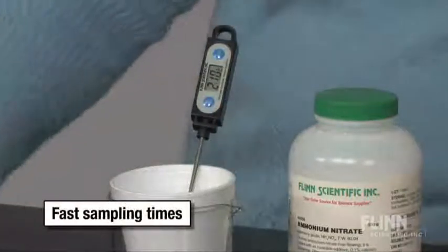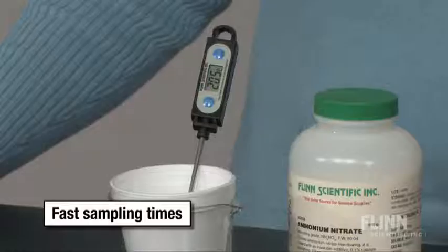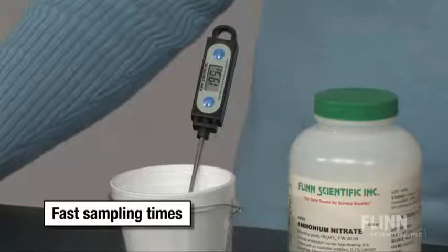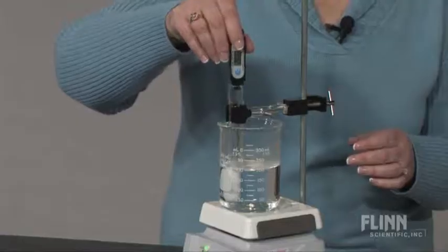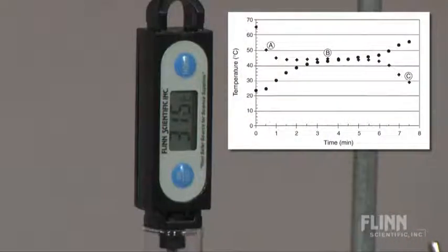Digital thermometers have fast sampling times, which coupled with 0.1 degree precision is a great advantage for temperature and heat experiments in all of your classes. Whether you're doing specific heat measurements, enzyme rates, heating and cooling curves, or enthalpy experiments, you'll always get accurate results using digital thermometers.